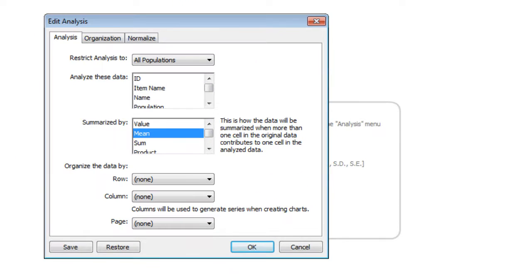This is where we're going to choose what to display, how to summarise it, and to show what it varies with. As a reminder, here we are interested in counting the number of foci and determining their mean intensity per nucleus. As we want per nuclei measurements, we need to restrict the analysis to nuclei and contained objects. As we're analysing the mean intensities of foci in two channels, FITC and Texas Red, the data mean FITC and mean Texas Red is selected. Hold down the Control key to select multiple items from this list.